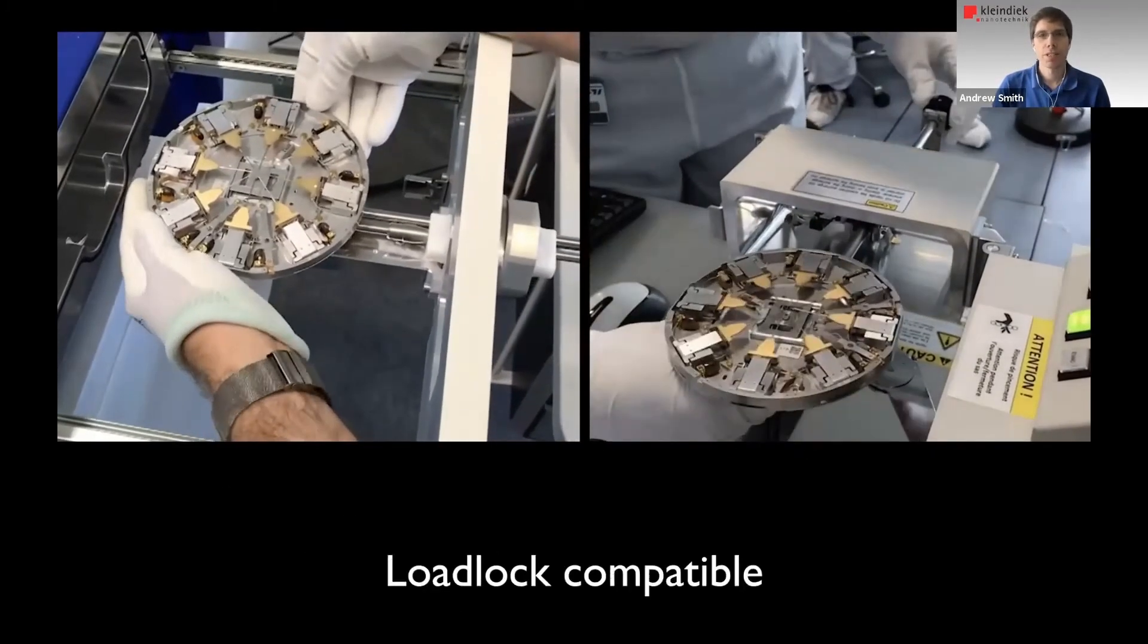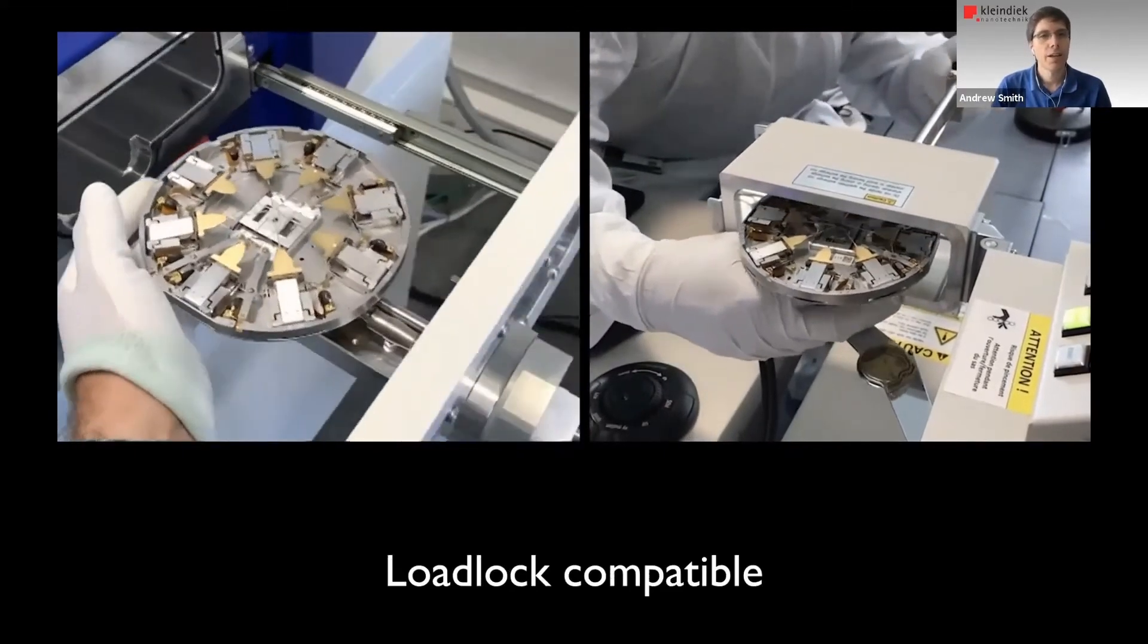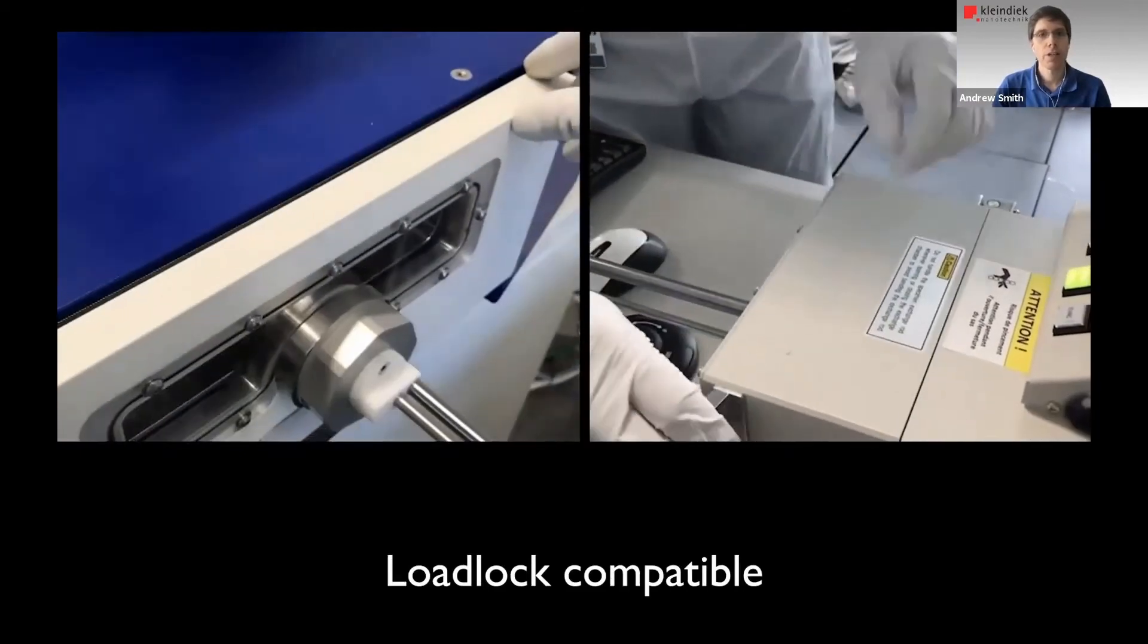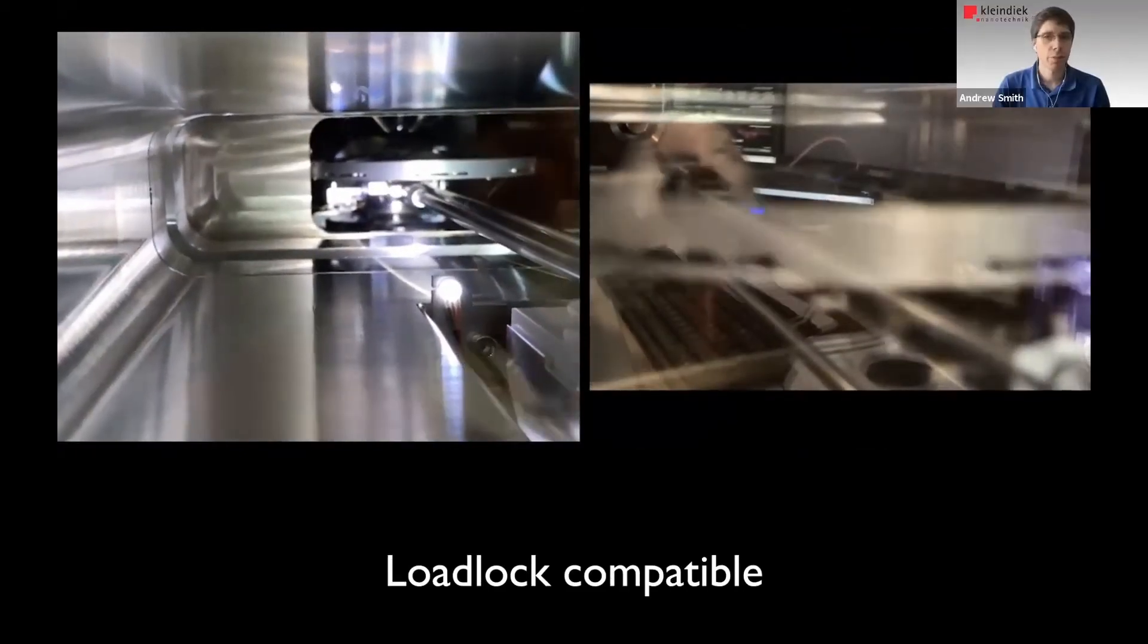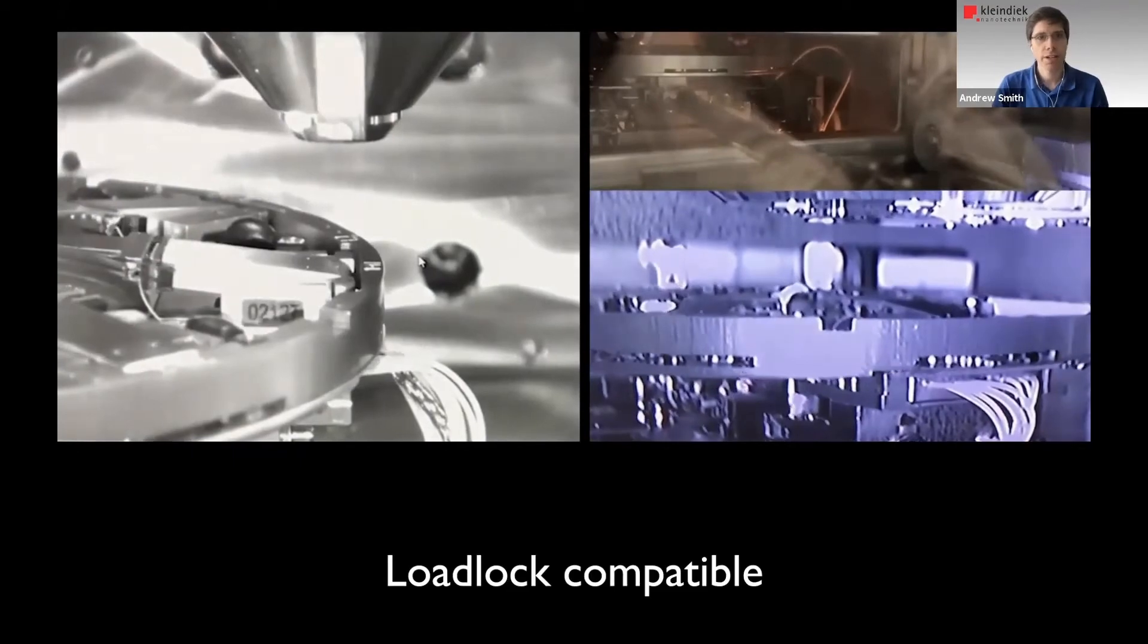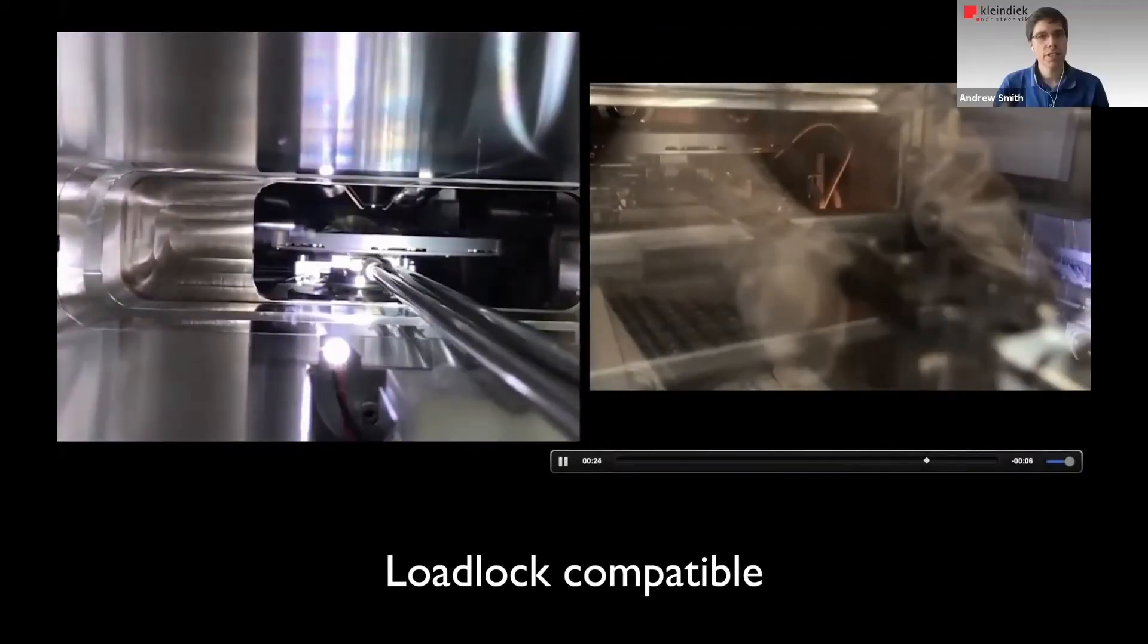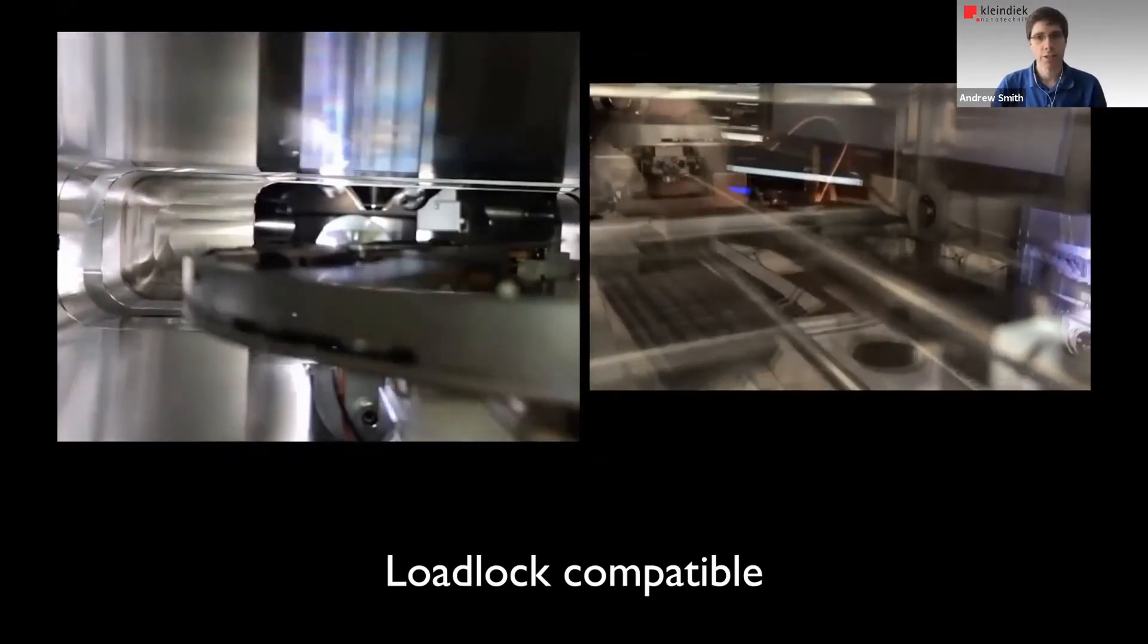Here's two videos. I hope you can see them fluidly of the Prober Shuttle being introduced into the chambers. On the left, we have a Zeiss system. On the right, we have a Hitachi system. But it can be any microscope in principle that has a sufficiently sized load lock. And on the stage, you can see here, there's a connector that allows the signals, the field drives, but also the measurement signals to be transferred to the outside of the chamber.